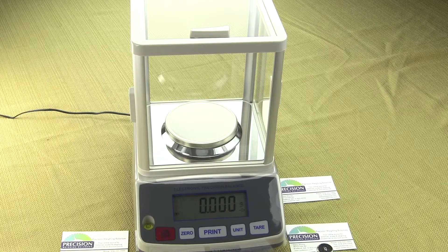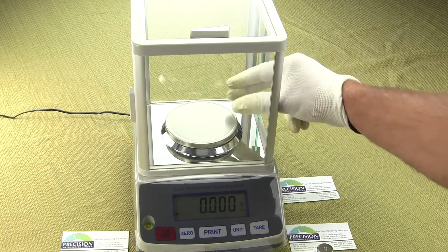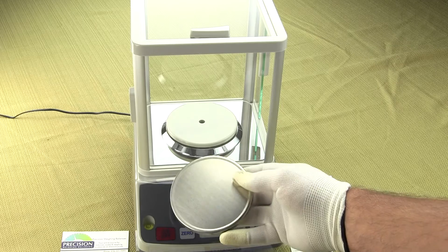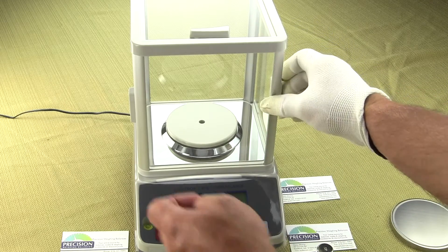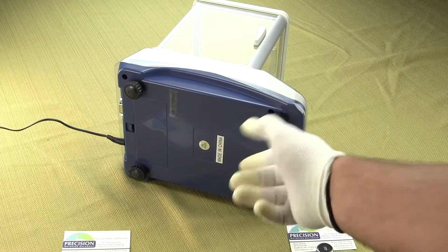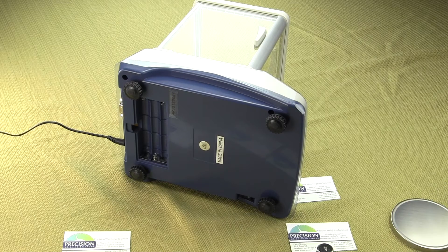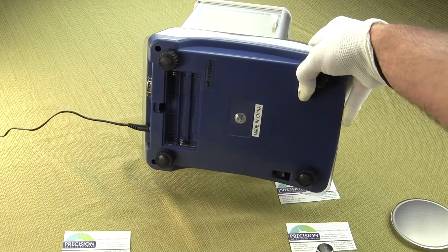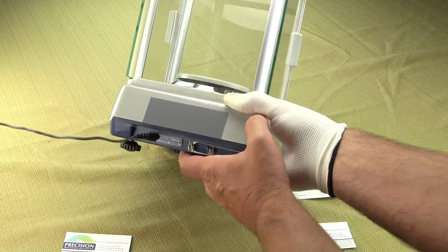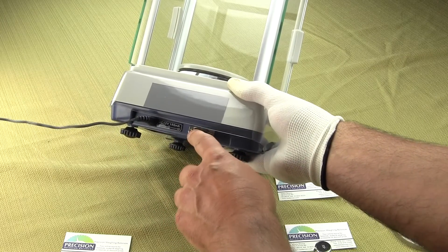It does come with an AC adapter and can also be powered off six AA batteries. There is a nice large 3.85-inch diameter weighing platform. On the bottom of the balance, you can see four adjustable feet, and in the rear there is a battery compartment for the six AA batteries. On the rear of the balance, we have the AC power input and there is a 9-pin RS-232 interface.